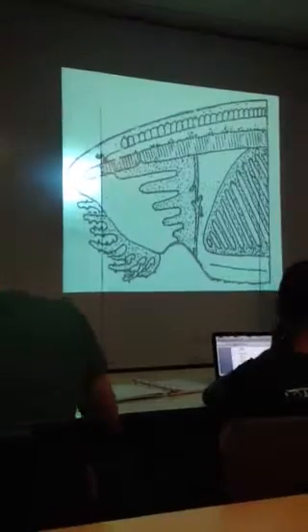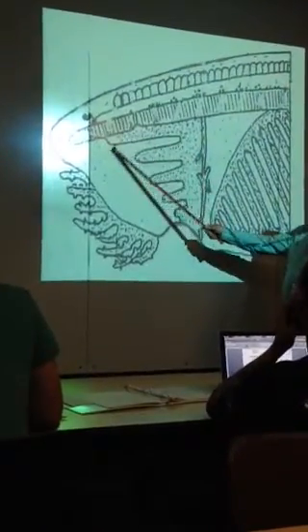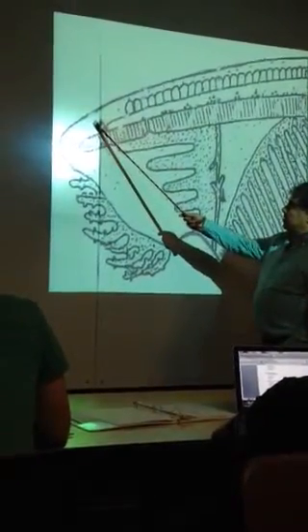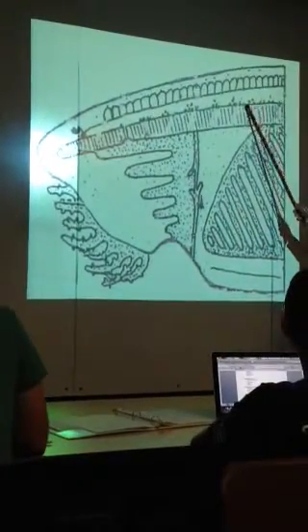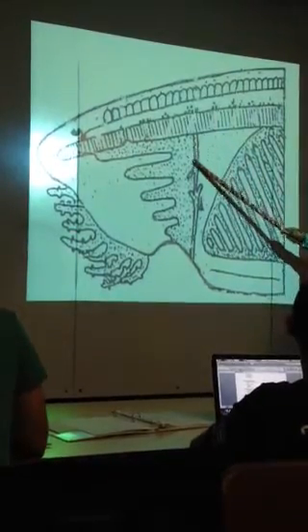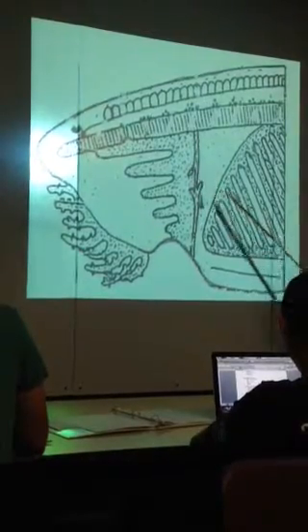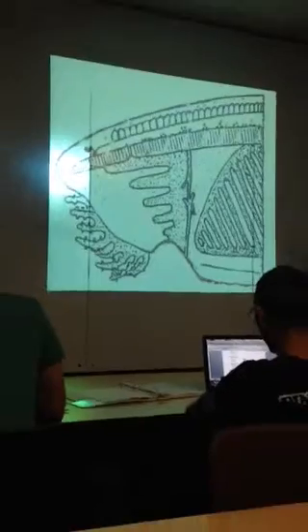Okay. All right, and this again shows you the wheel organ, Hatschek's groove, Hatschek's pit. There's your pigment spot. There's your flagellated pit. Here's your notochord. Notice they do it like this with the little lines coming down, because if you look at it under high mag, you actually see those little lines. Here's the velum coming down here, and these are the drawings of the velar tentacles. Okay?